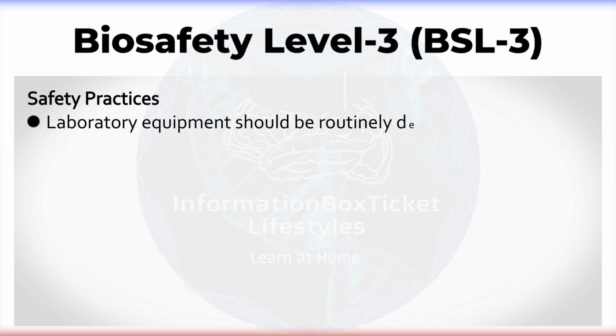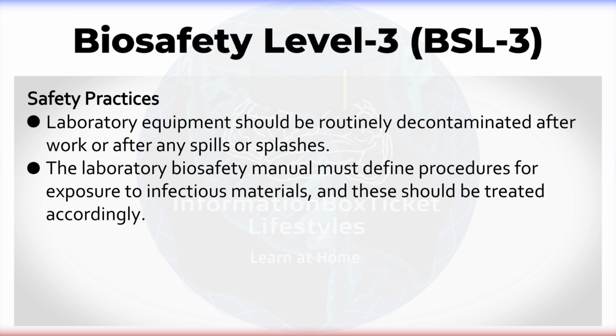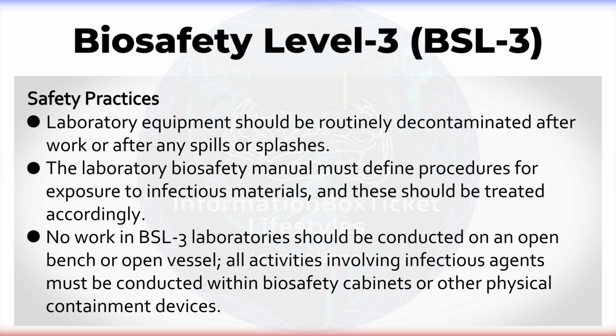Laboratory equipment should be routinely decontaminated after work or after any spills or splashes. The Laboratory Biosafety Manual must define procedures for exposure to infectious materials, and these should be treated accordingly. No work in BSL-3 laboratories should be conducted on an open bench or open vessel. All activities involving infectious agents must be conducted within biosafety cabinets or other physical containment devices.